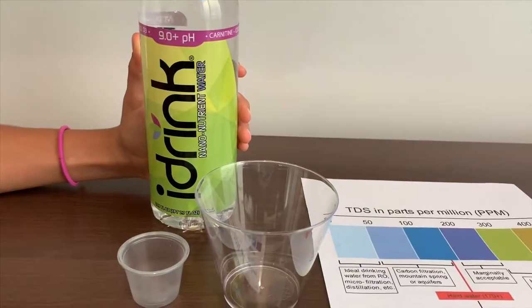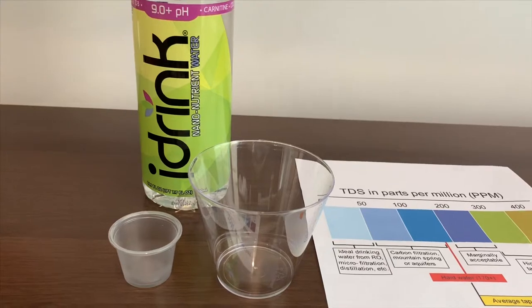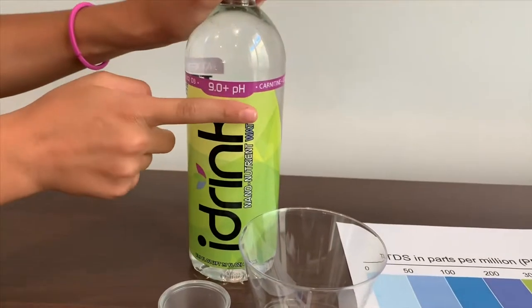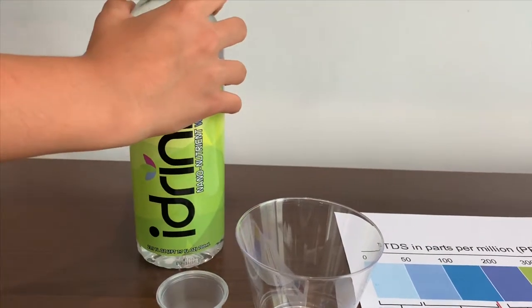This is 9-0-0 nutrient water. It says it is supposed to have a 9 pH level, so let's test it and see if that's true.